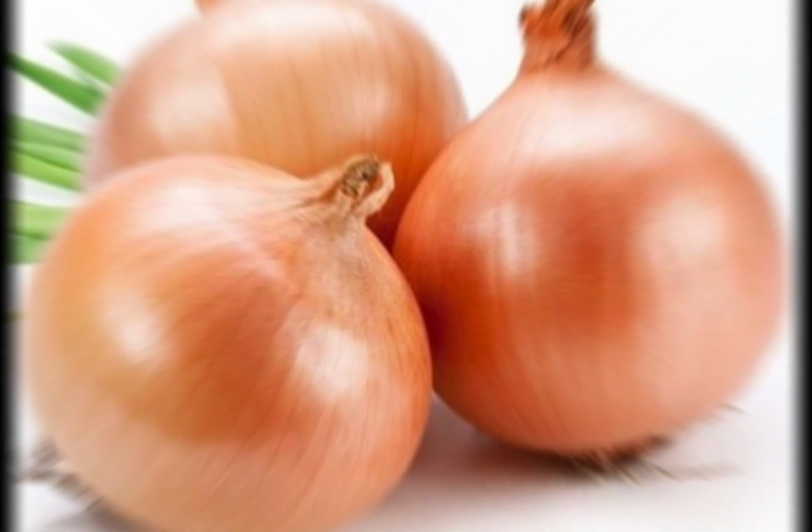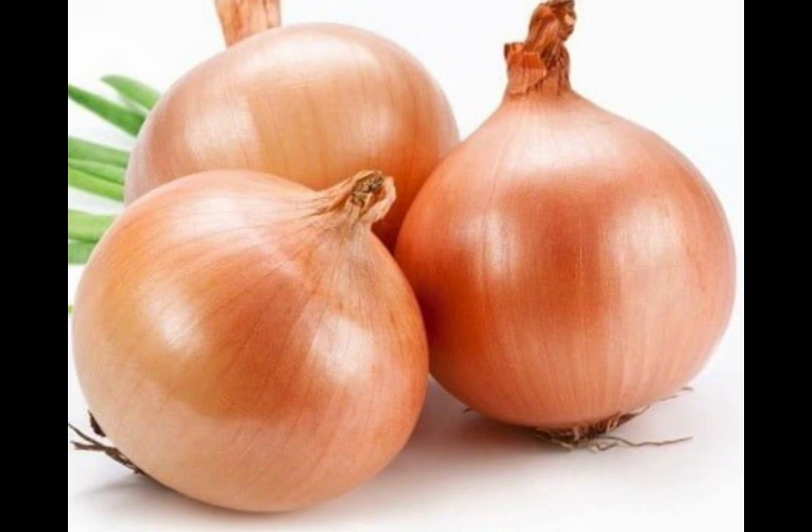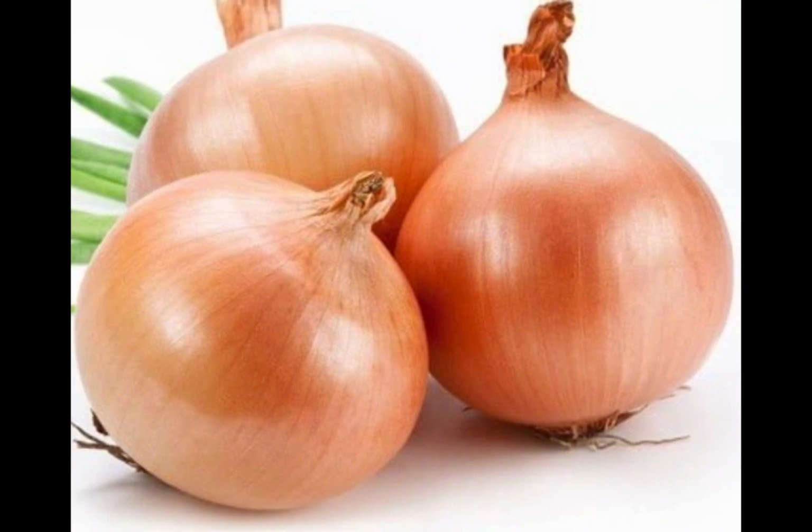The layers of an onion contain simple sugars, some of which are stored as starch, which is also known as starch granules. Given that iodine tends to bind to starch, it stains starch granules when the two come into contact, making them visible. Although onions may not have as much starch as potato and other plants, the iodine stains allow for little starch molecules to be visible under the microscope.